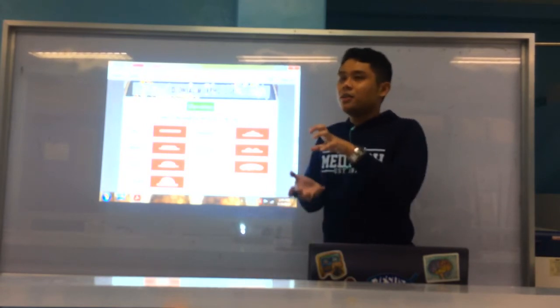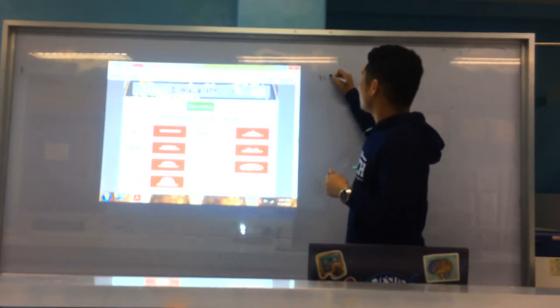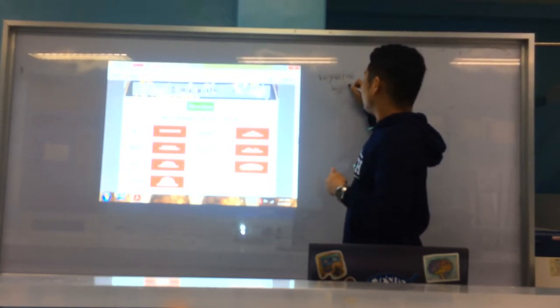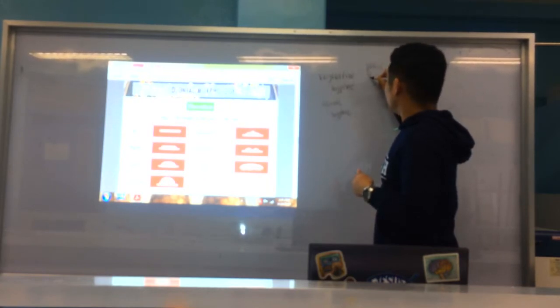Okay, because your fungi, man good, they have the vegetative hyphae, you have the aerial hyphae. Mycology? Yes. So you have the vegetative hyphae and the aerial hyphae. Okay? So basically, sa imong culture media, if imong colonies in ana, so nana siya yung mga inana ang fungi, and then napod diri.